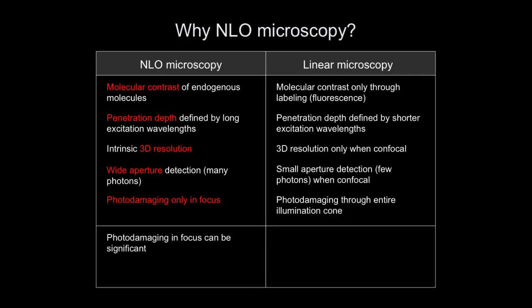Okay? Now, there's some disadvantages too. So these are the advantages of nonlinear optical microscopy. These are the disadvantages. Yes, photodamaging only occurs in focus, but if it happens, it can be pretty bad. The photodamaging in focus can be significant.